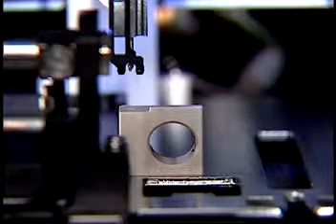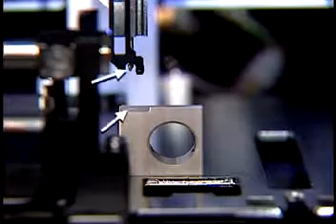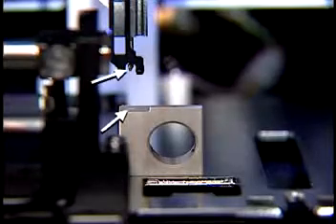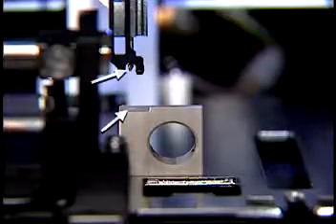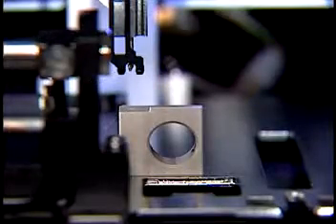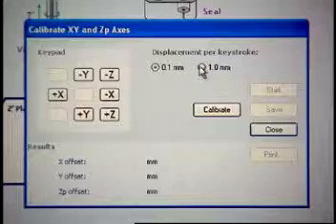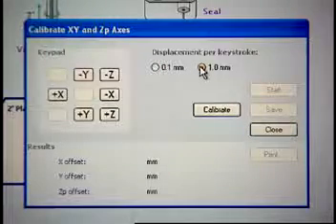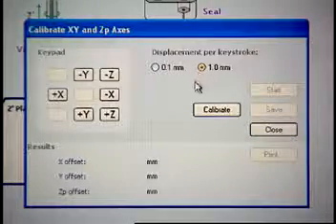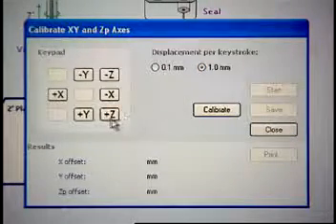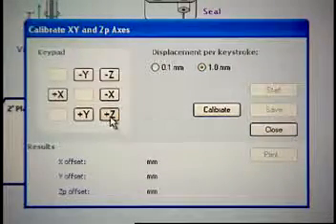Next, examine the location of the puncture needle relative to the hole in the teach block. Choose the 1.0 mm displacement increment, and then click the plus Z button to position the XYZ mechanism foot close to the top of the teach block. Each click of the mouse moves the needle 1 mm.